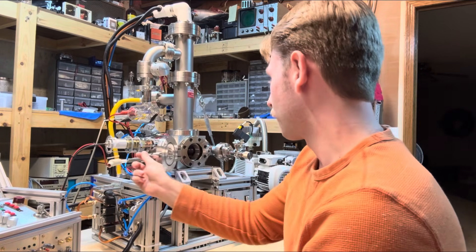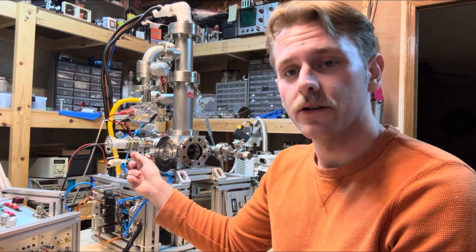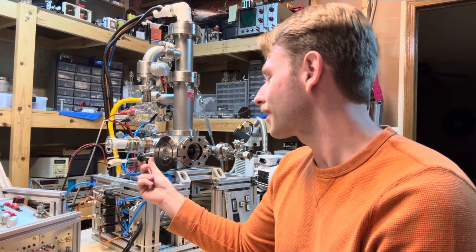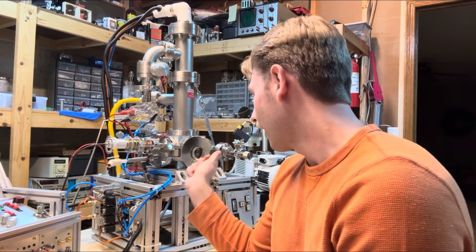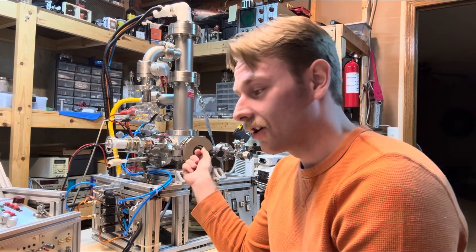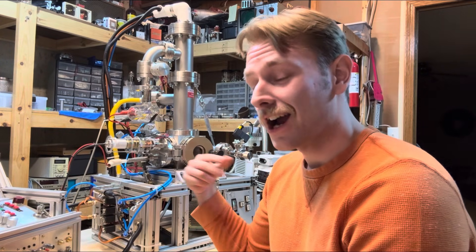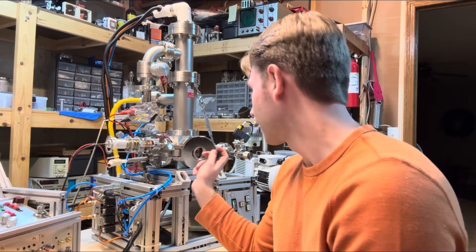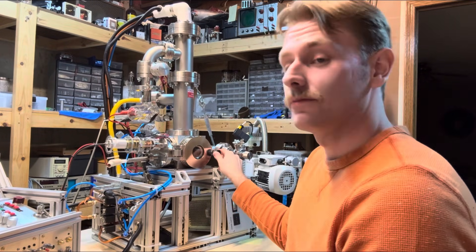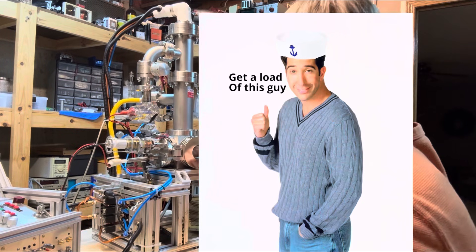Well, I got really lucky with some of these parts. Like this right here. I would not want to go onto KurtJLesker.com and pay $1,500 for this thing. So I was just like, look, there are some people that stalk people. But I stalk things on eBay. And that's when I found this guy for $150. Get a load of that. I was a happy sailor.